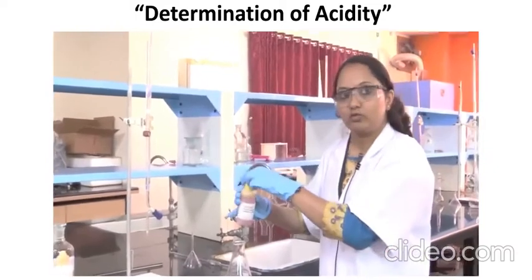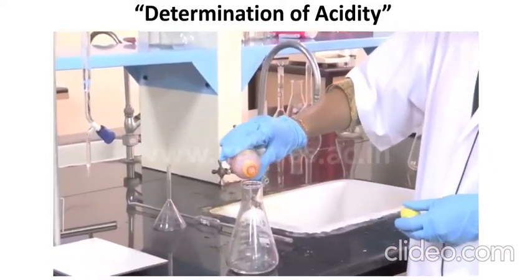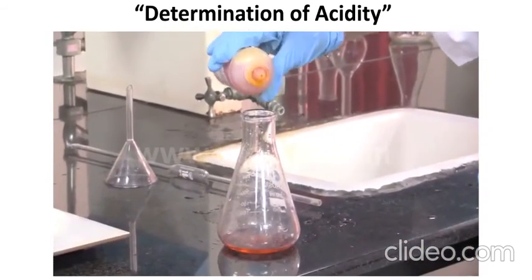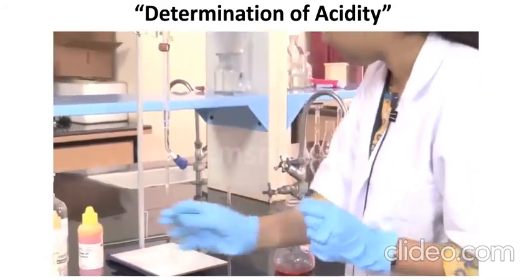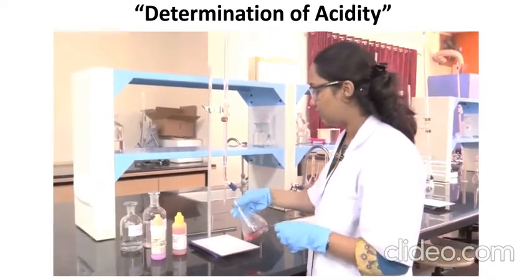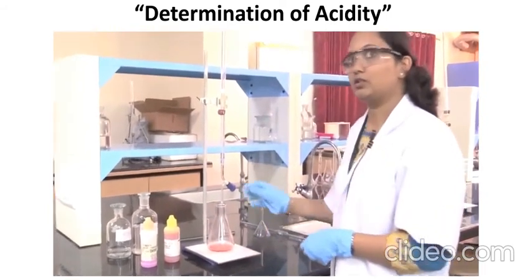Now add 2 to 3 drops of methyl orange indicator. Color changes to red. Now this has to be titrated against 0.1 normal sodium hydroxide solution.